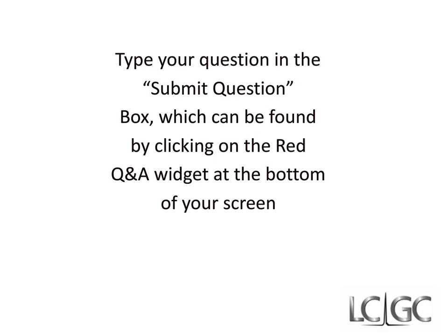Well, depending on what high salt is, that's difficult. Depending, again, if it's in solution, salting something out would be a function of some sort of... well, if it's solid phase extraction, you're going to try to pick a cartridge where those salts may stick to that. But in getting salt out of a solution, you have to use a nonpolar solvent and somehow do some sort of partitioning. So depending on the salt in particular, some salts, by adding certain other chemicals, will precipitate right out.